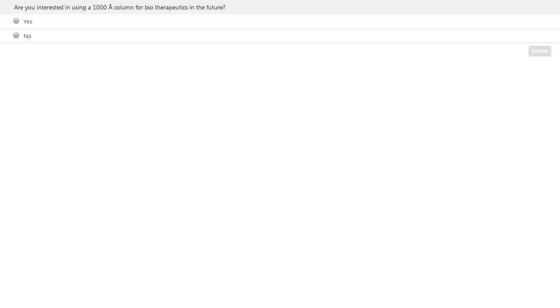Okay. Another question is, how does the HALO 1000 columns compare to SEC for monoclonal antibody analysis?